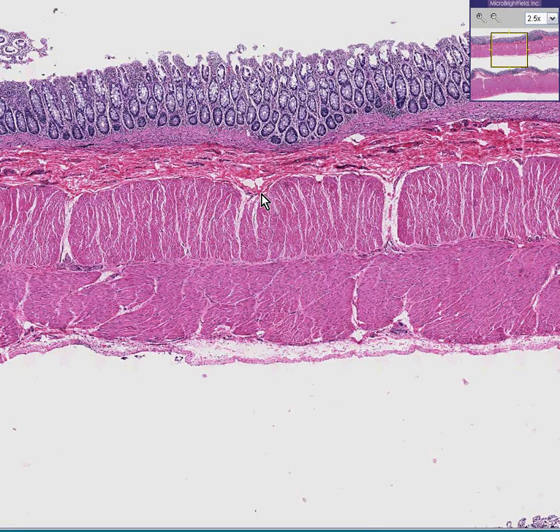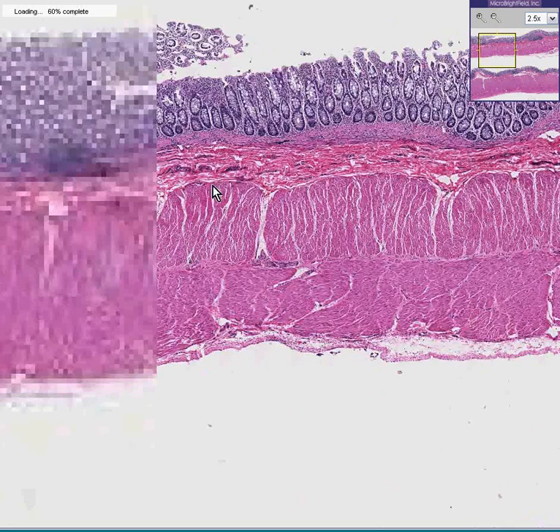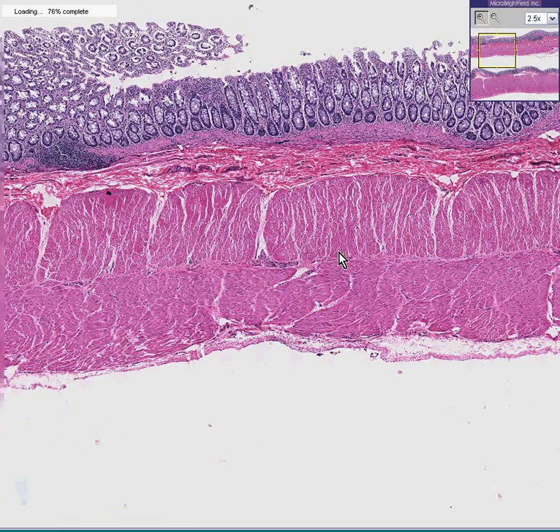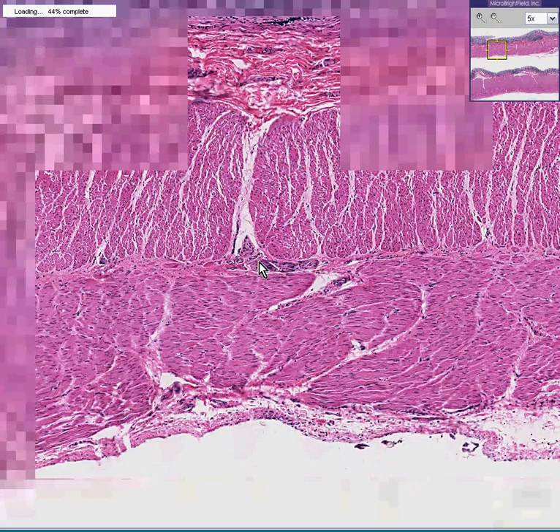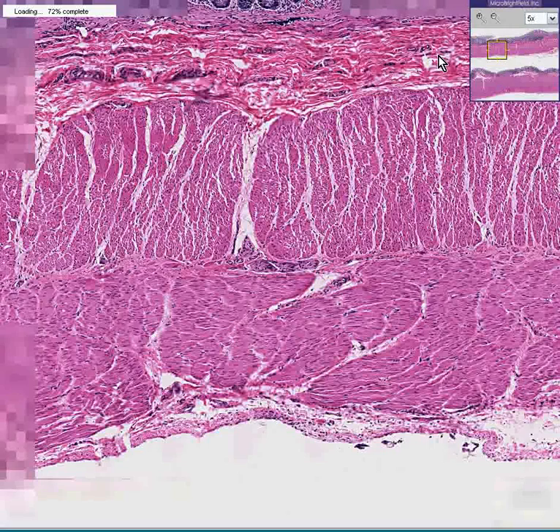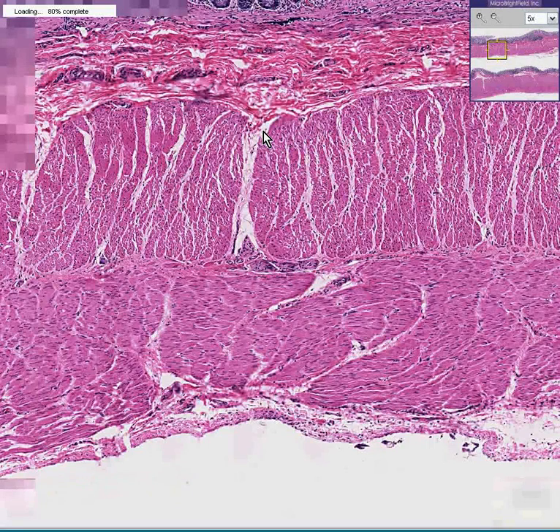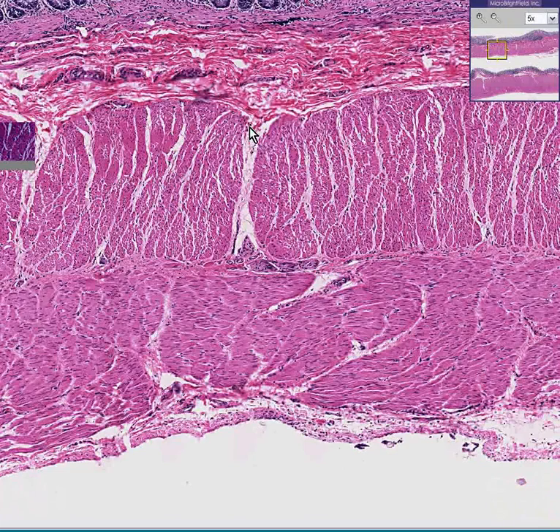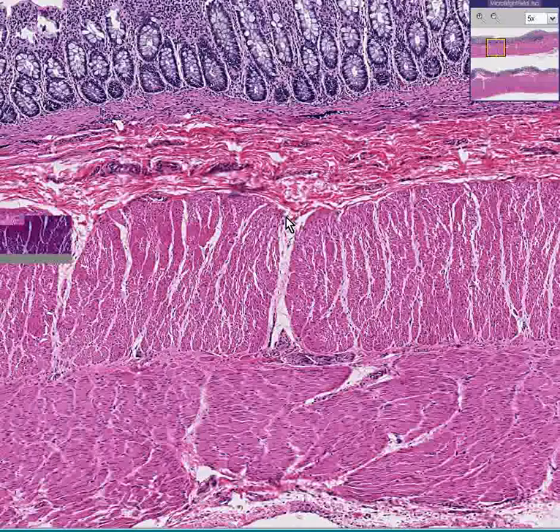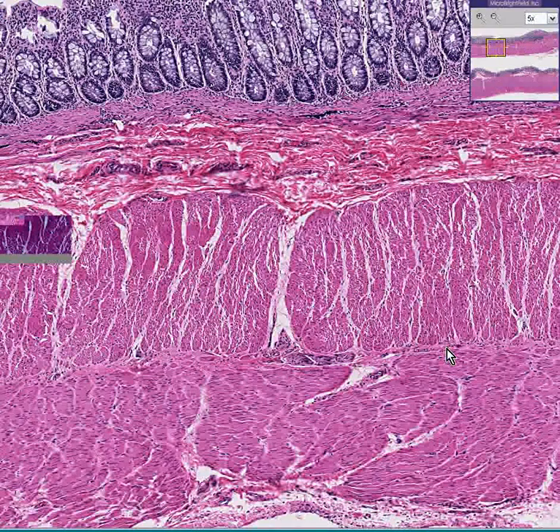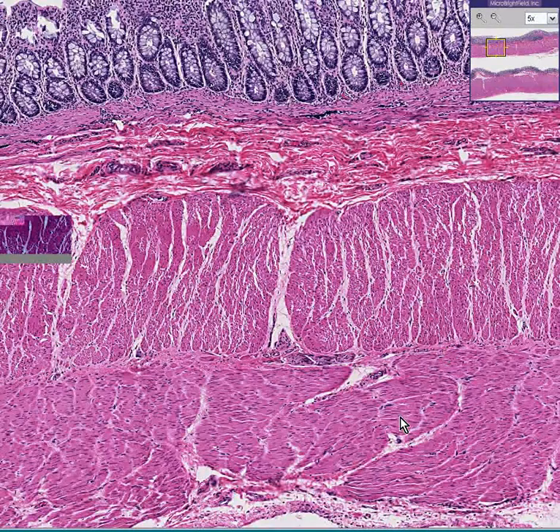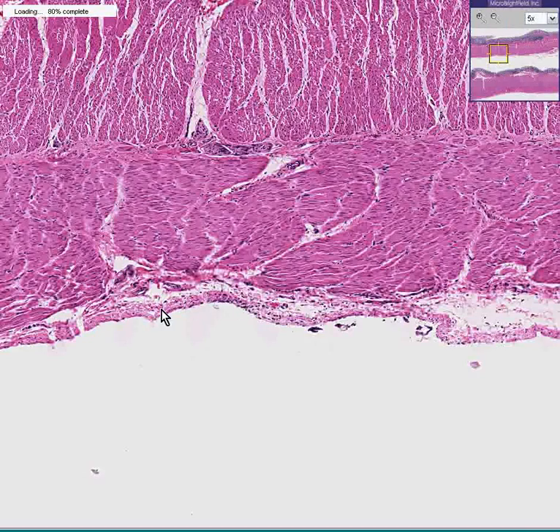If you look here, you could probably see something that might look like nerves, and probably will be, but notice there are no ganglion cells — there are only little nerve fibers there. So if you are really thorough, and besides looking for the four classical layers of the colon, you also looked for the submucosal and myenteric ganglion cells every time you looked at a colon, then you would see that this one is absent. You can also see in this colon, for some reason, there's a little bit of chronic inflammation along the serosa as well.